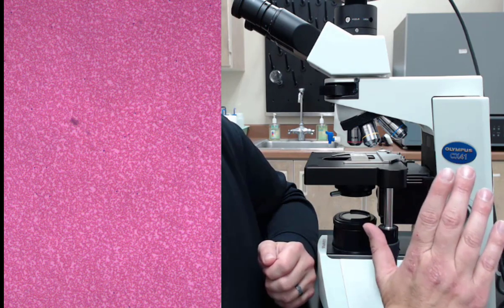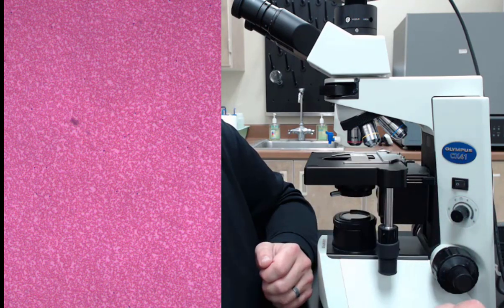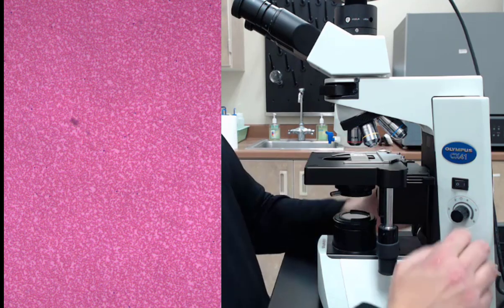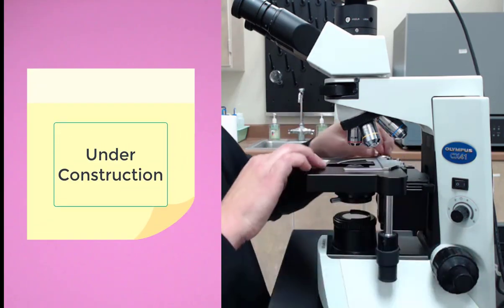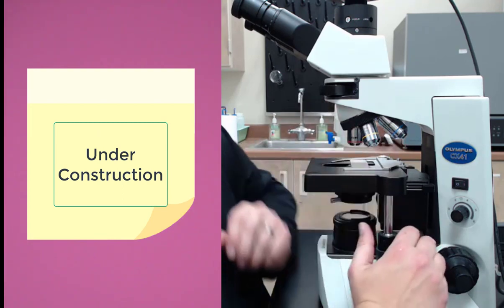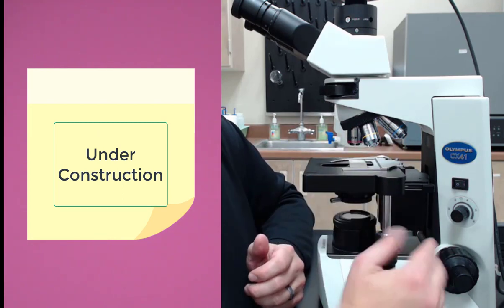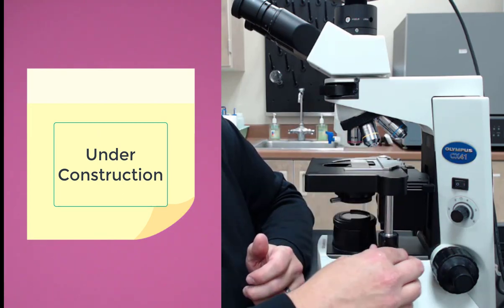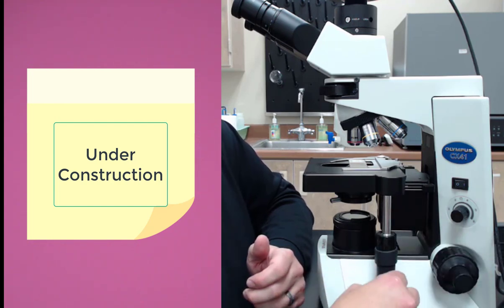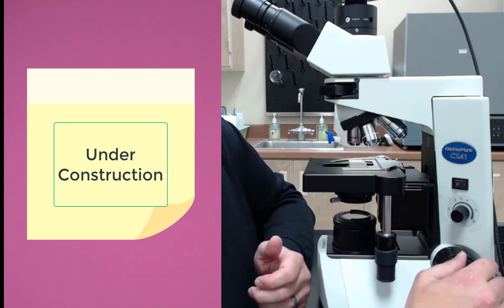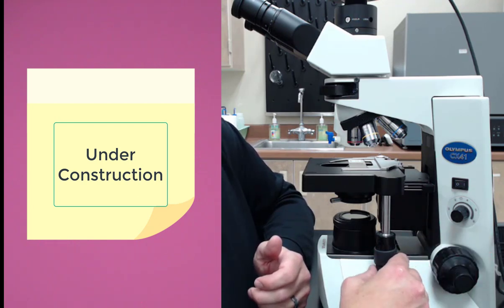I'm actually going to take it out of focus. I'm going to take you all the way from the beginning when I first put the slide on the stage here. First thing, when you put the slide on, you want to make sure that it slides right into this little lobster claw here. And then you move using these two knobs here, the top knob, moving the slide forward and backward, bottom knob side to side. Then you're going to put the image right over your light source.